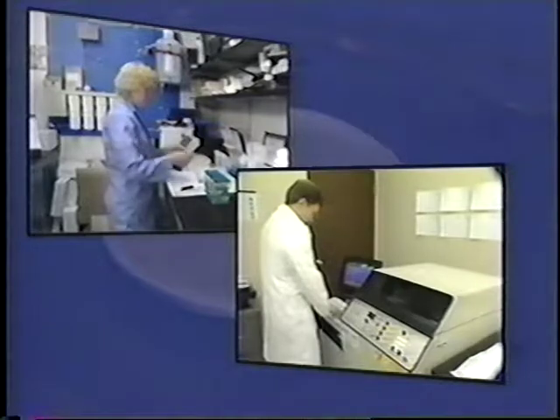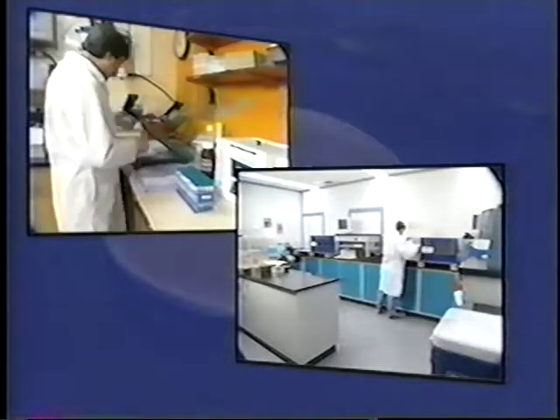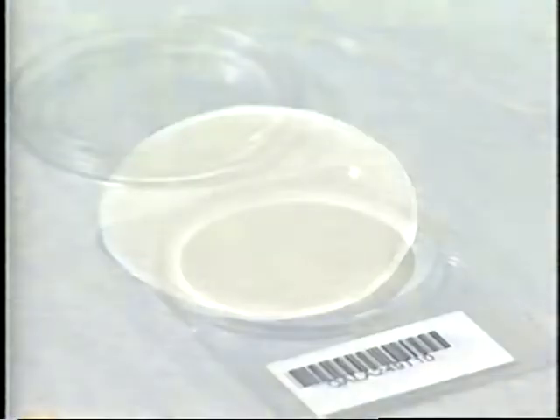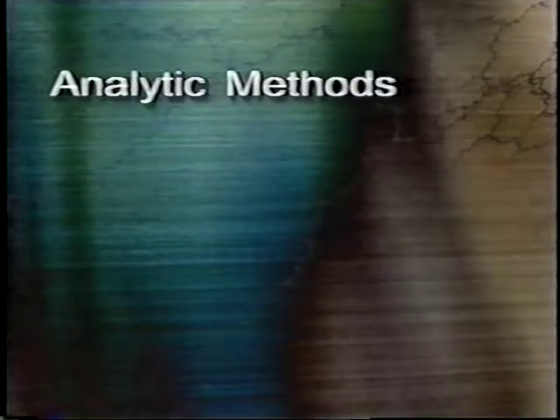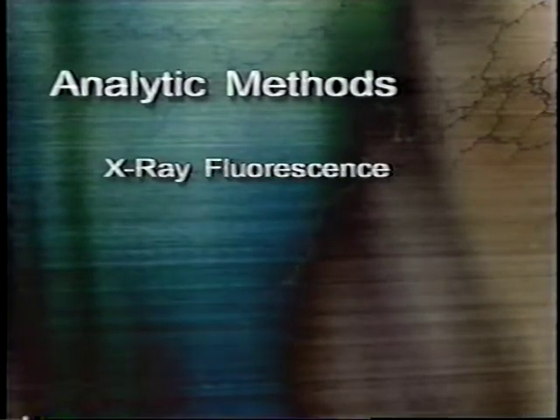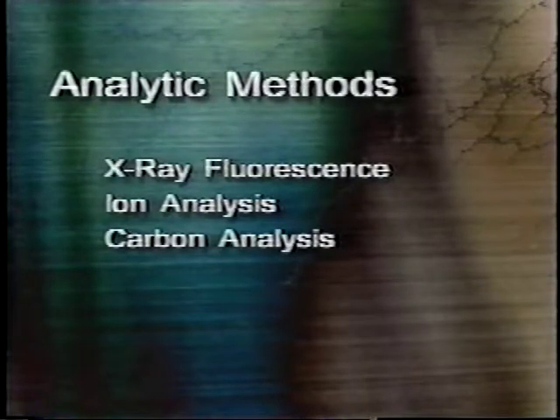In order to determine the chemical composition of collected PM samples, a variety of analytic techniques can be used. Since air filters contain very small particle deposits, preference is given to methods that can accommodate small sample sizes. Three commonly used analytic methods that meet these requirements are energy dispersive X-ray fluorescence, or XRF, for elemental analysis, ion analysis for major ions such as nitrate, sulfate, and ammonium, and carbon analysis for organic and elemental carbon. While there are many other analytic methods used for speciation, we will focus only on these three.